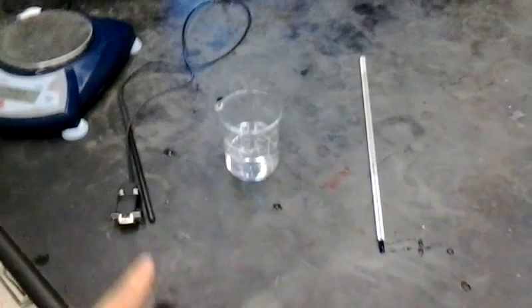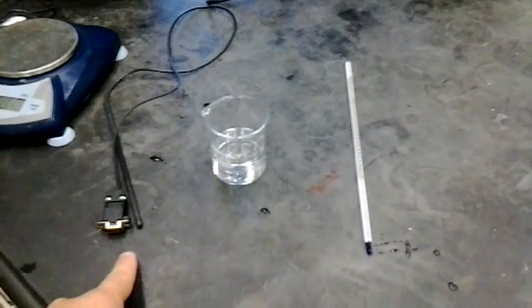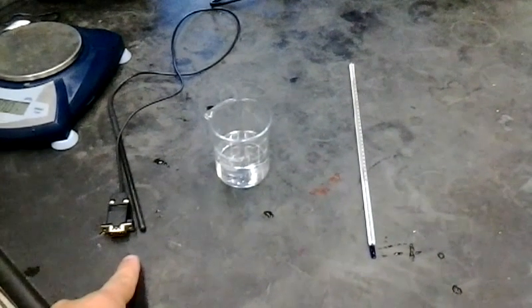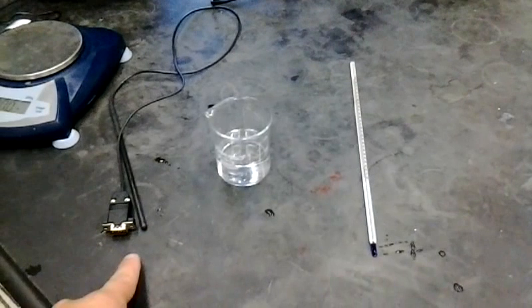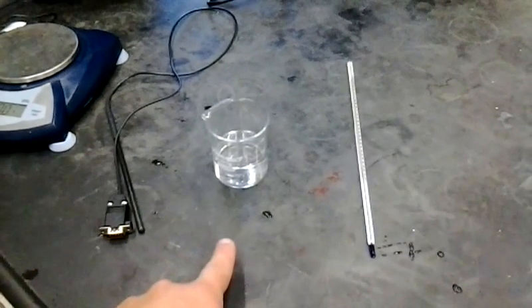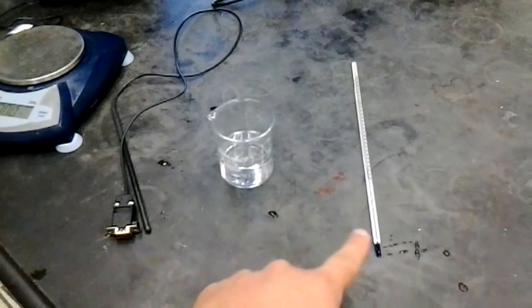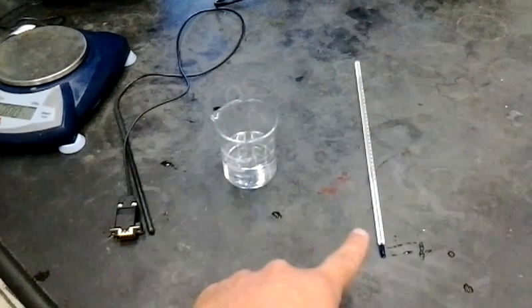So you will need a temperature probe for the MeasureNet system over here to my left, a beaker of water, and of course a thermometer on my right.